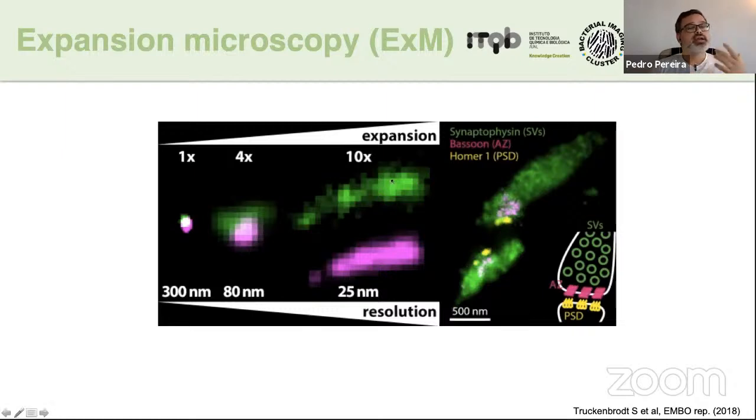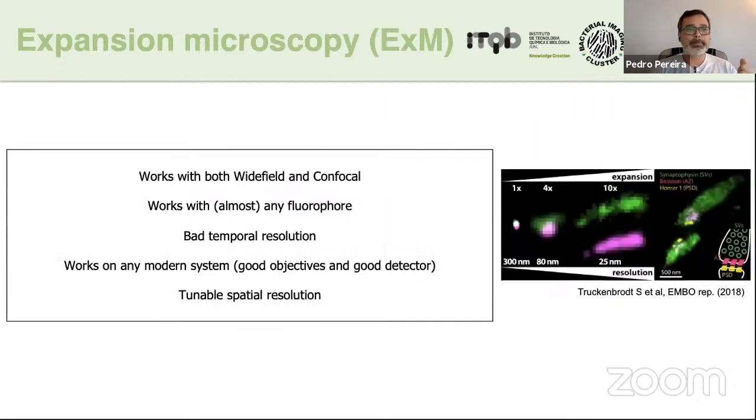So again, expansion microscopy allows you to go from non-expanded to tenfold expansion without any special kit or any special microscopes. And it's quite easy to do, to be totally honest. Okay, so what do you have? It works with both widefield and confocal, just like SRRF. Actually, you can mix them together.